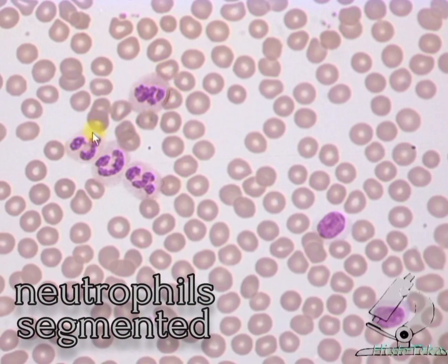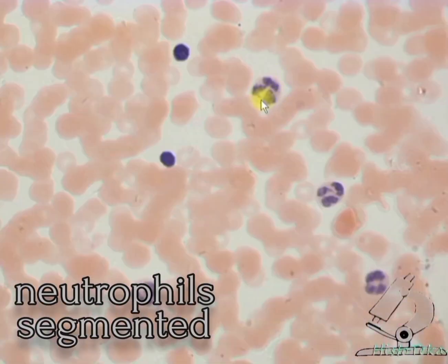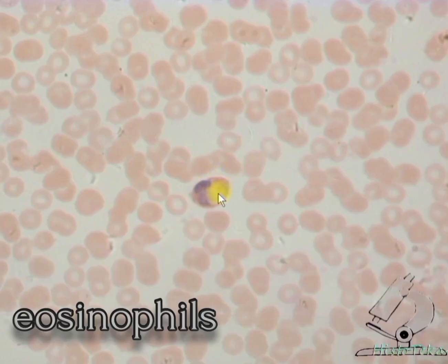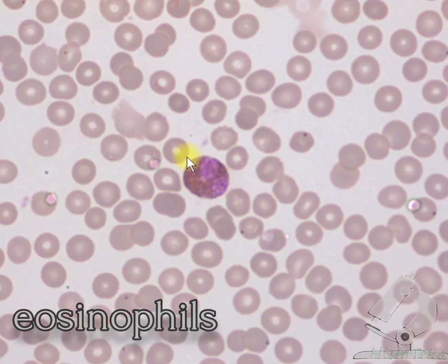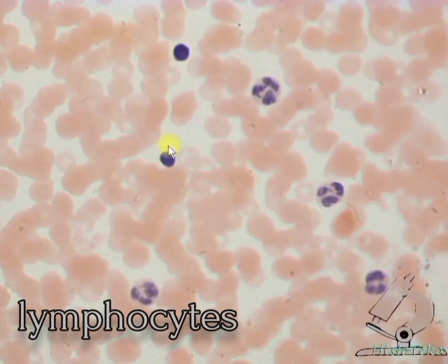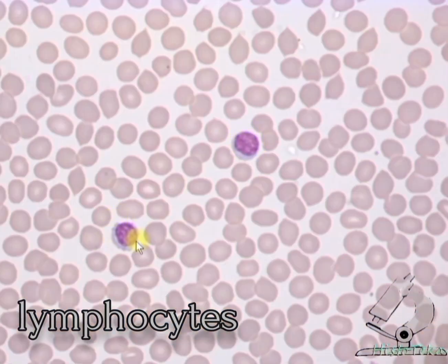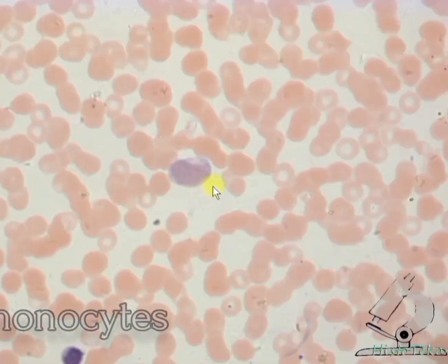Neutrophils segmented. Eosinophils. Basophils. Lymphocytes. Monocytes.